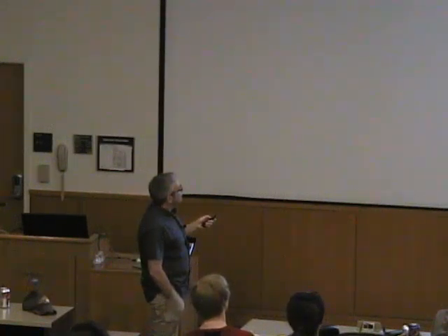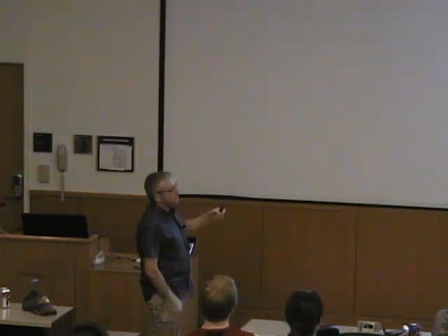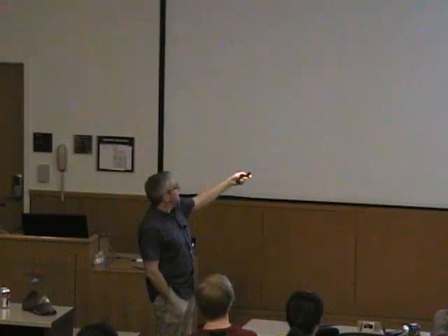The reciprocal lattice is built like this. So this is not 3-dimensional, it's a 2D picture. The reciprocal lattice has reciprocal dimensions. So A star, the reciprocal axis, has inverse length of A. It's kind of hard to show this in one picture, so it starts to be a bit imaginary. And it's orthogonal. If it's A star, it's orthogonal to the BC plane. So it's just inverse if it's an orthogonal cell, but if it's not, then it's a bit crooked. But it's rather simple to basically calculate.